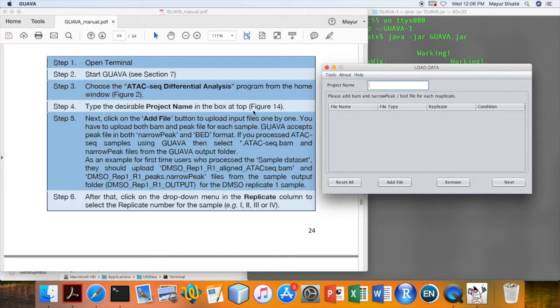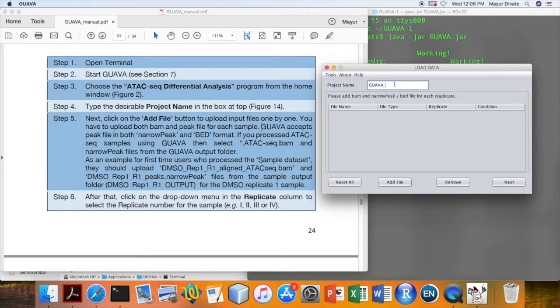Once it is open, then we will need to assign a project name. Here I am going to use GUAVA Demo as a project name.